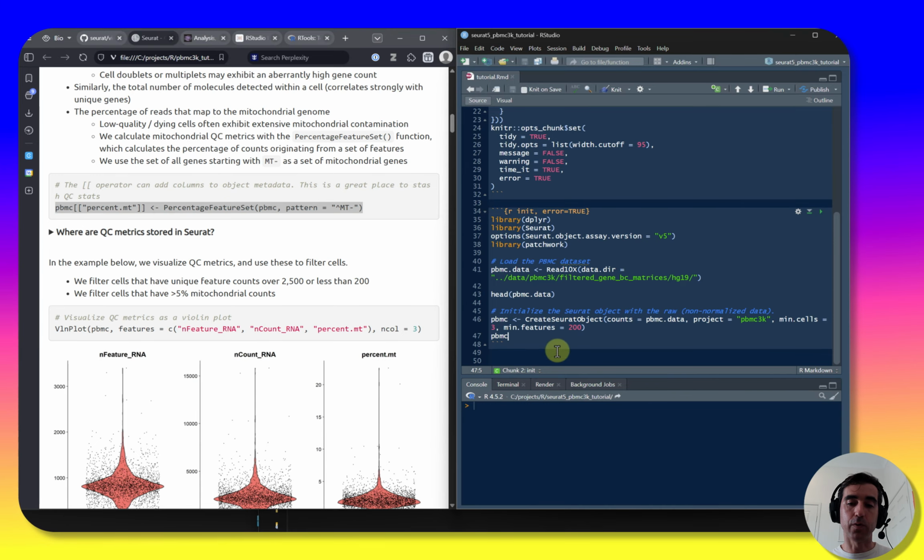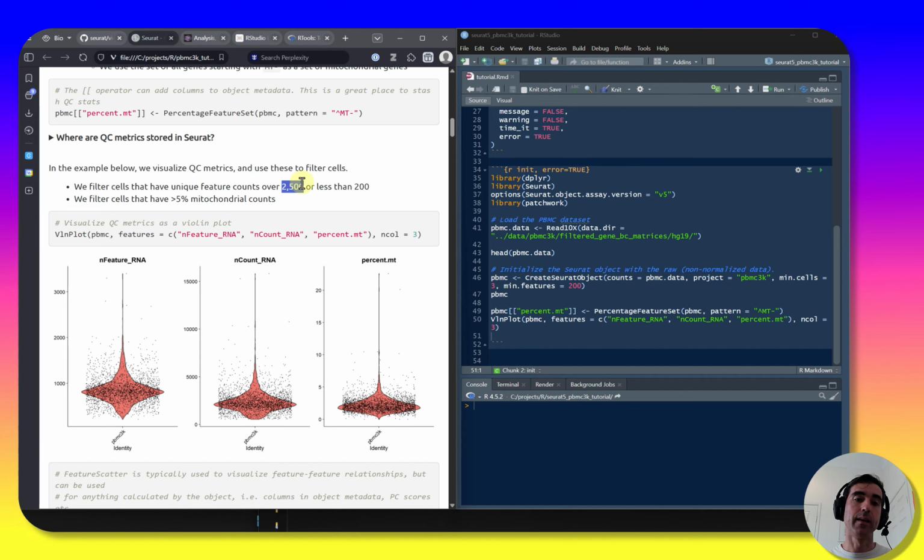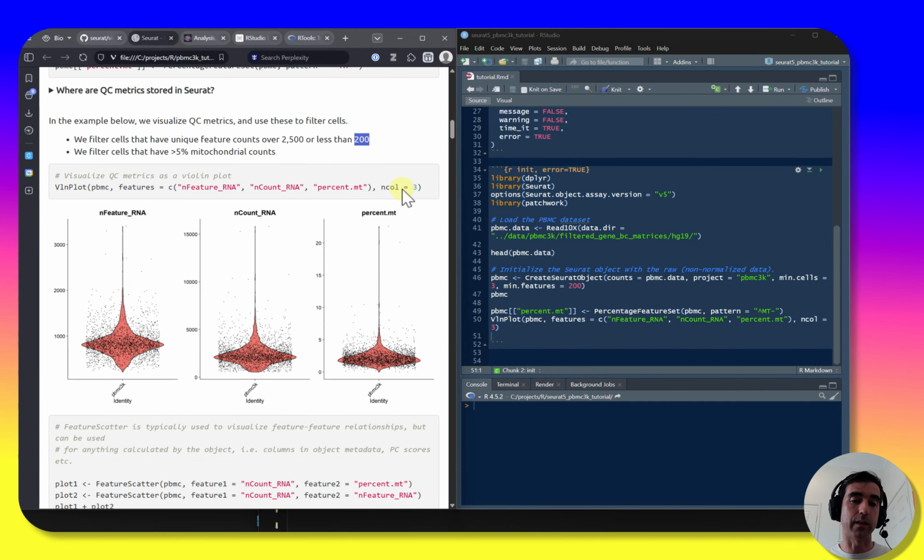What other things are going to be discarded? We're going to discard cells that have too many gene expressions, and we're also going to discard cells that have too little. What does each thing mean from a biological sense? I don't have that intuition because, as I mentioned, I'm only just starting out this journey. From a quick read, it seemed like if there are just too many genes being expressed, it could represent that two cells were added together in one entry. So that's not really a valid entry. And I'm not too sure what it would mean that a cell has just too little expression.